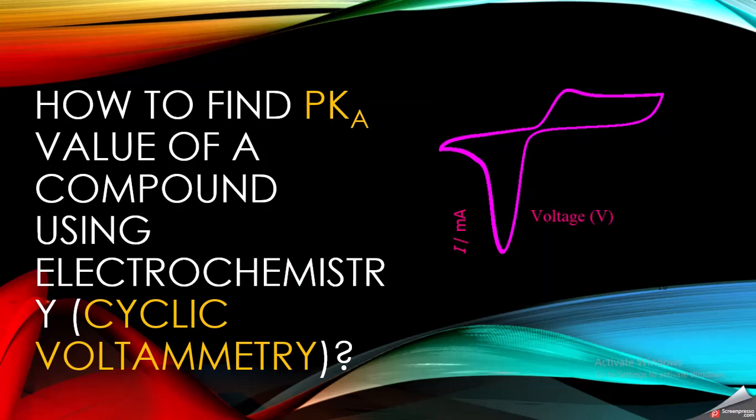Hello students, in this video we are going to see how we can find the pKa of a compound using electrochemistry, specifically cyclic voltammetry. In my previous video we saw that we can find the value of pKa using electronic absorption spectroscopy. But there are other techniques, such as CV or other electrochemistry techniques like differential pulse voltammetry or square wave voltammetry. In this video, we are going to see how we can use cyclic voltammograms to find the value of pKa.